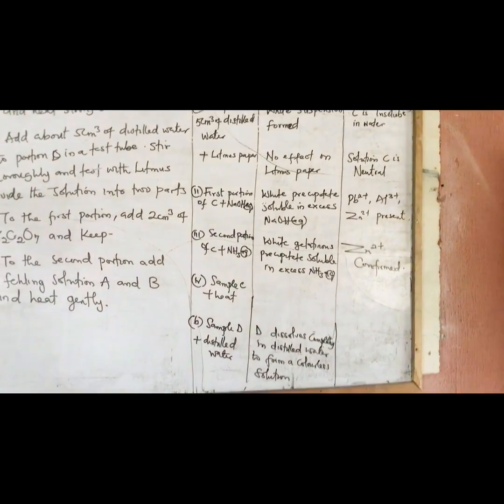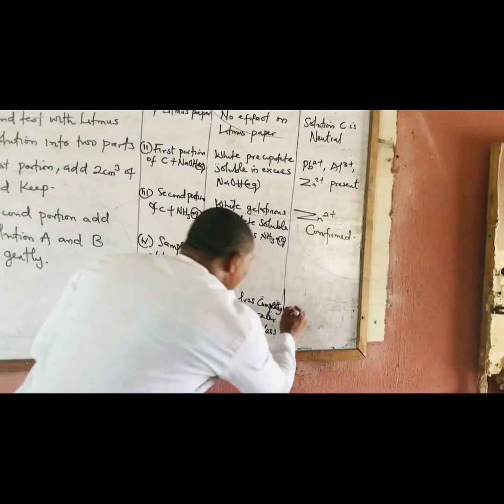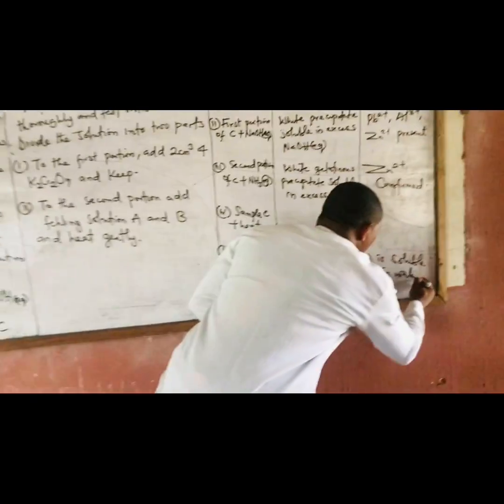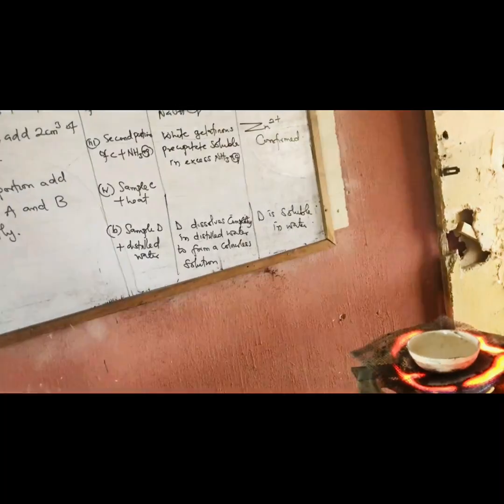If it dissolves completely, then I can say D is soluble in water. That is my inference.